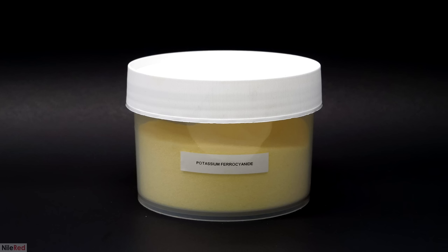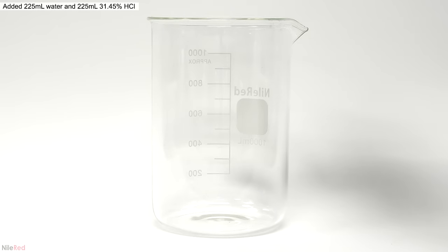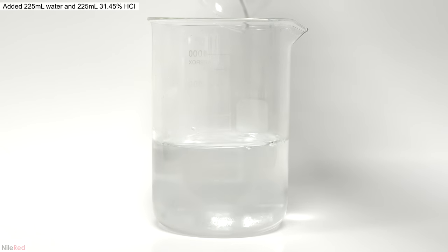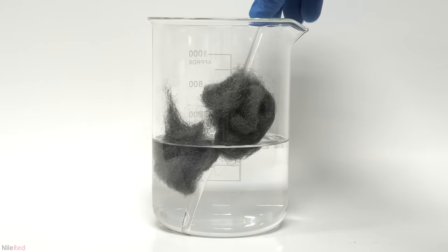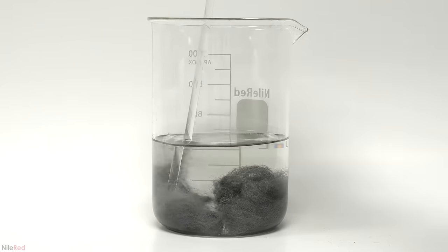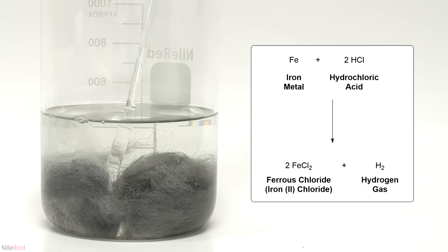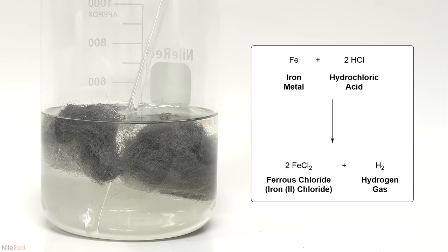If you have a decent method for making ferrocyanide, let me know in the comments. I can make the ferric chloride though using hydrochloric acid, steel wool, and hydrogen peroxide. The acid and the steel wool are easy to find at the local hardware store and the peroxide is just from the pharmacy. To start off, I added 225 ml of water followed by an equal amount of concentrated hydrochloric acid, mixed it around for about 30 seconds, and then added some small pieces of steel wool. In total I'll be adding 50 grams of it, but I wanted to start slowly to make sure the bubbling didn't get out of control. What's happening here is a reaction between the iron in the steel wool and the hydrochloric acid to make iron 2 chloride, also known as ferrous chloride, and hydrogen gas.